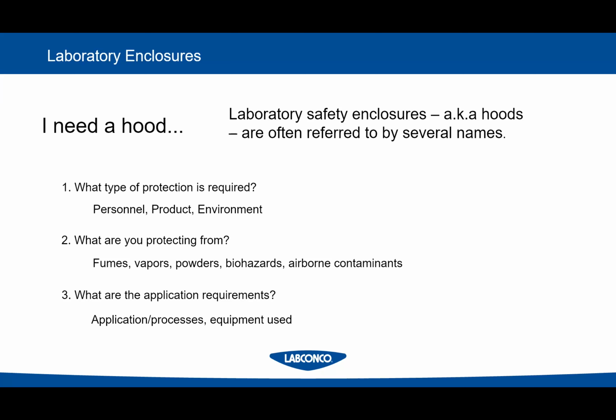Sometimes they're like, well, I have this piece of equipment. Okay, well, what's that piece of equipment going to put out? What is its risk? Why do you not want it on a bench top? It's basically what we're asking people at this point: why do you want to put this in something instead of letting it sit out on the bench? So you're trying to find out what they're doing.